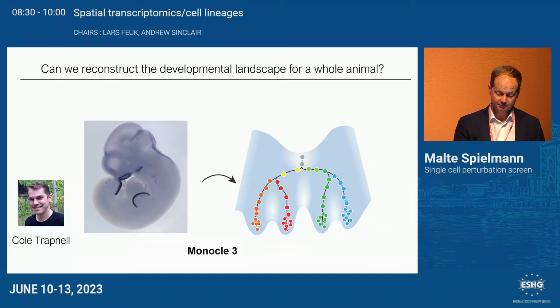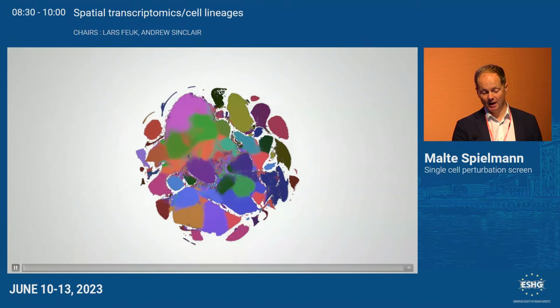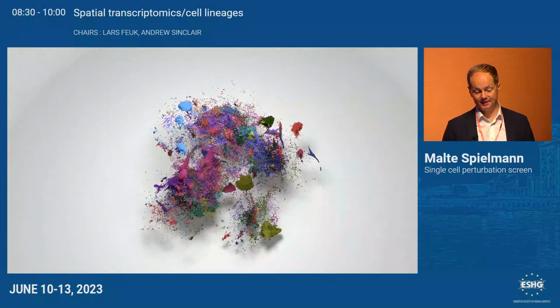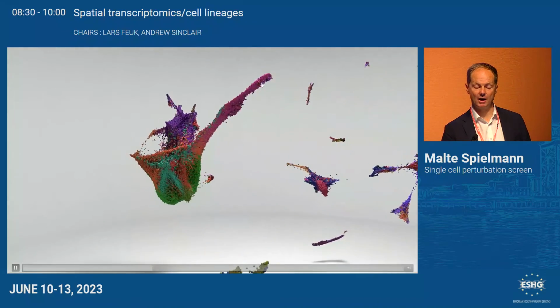And this is actually exactly what we did, and now I'm showing you a movie that has been shown at this conference several times, but I still show it. This is our initial embryo UMAP, and there, for example, the hepatocytes are very close to parts of the brain, and I don't really know the origin of the different cell types. And that's why what the algorithm now does is it clusters each cell based on its origin. And now, for example, all these cells here represent the mesenchyme, and you can see through developmental time, these are the muscles growing out of the mesenchyme.